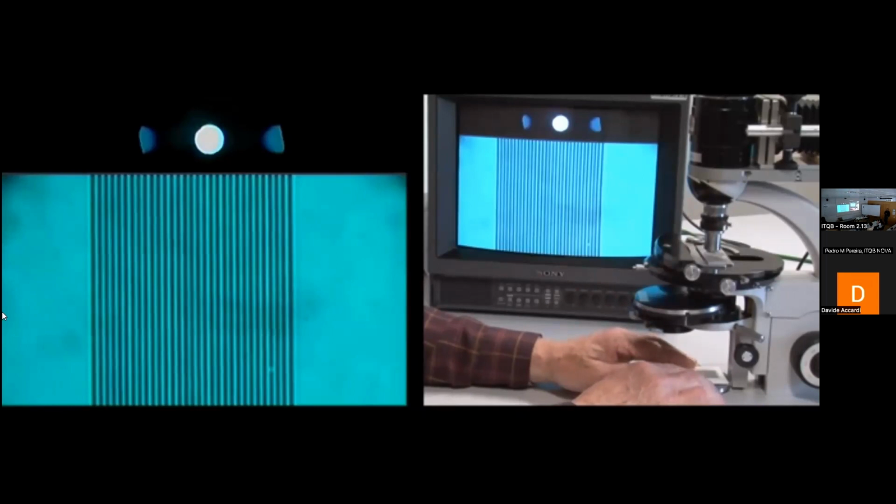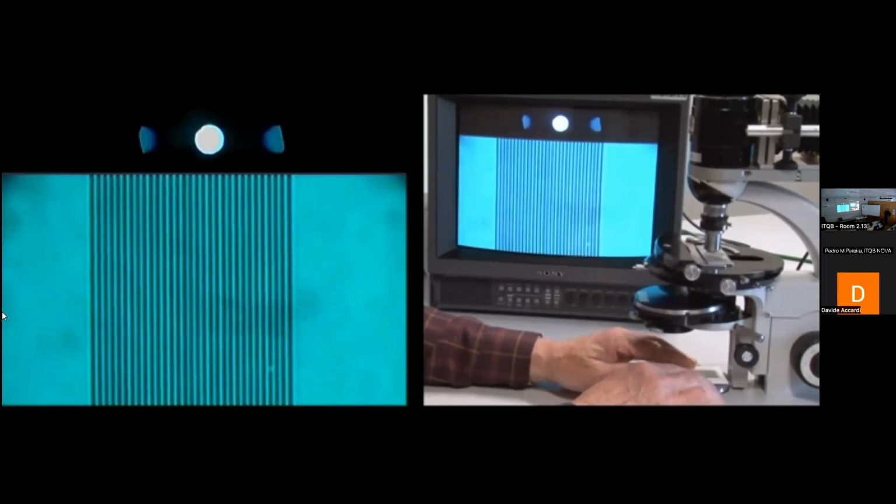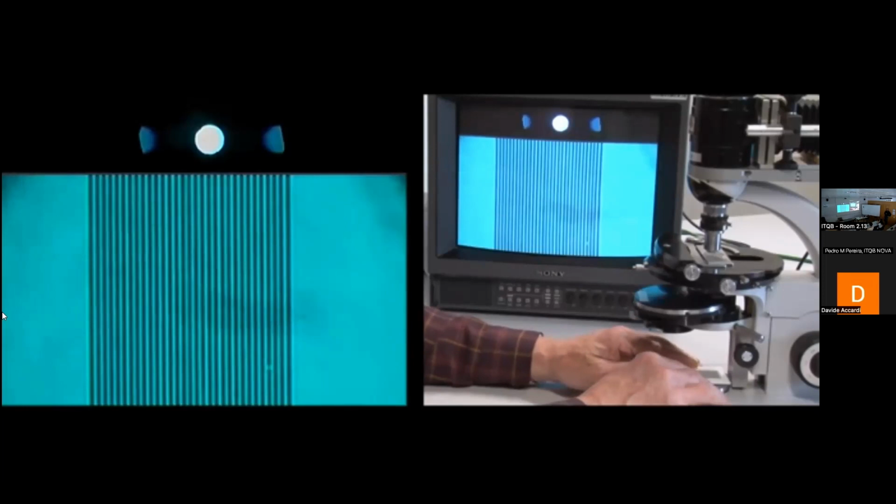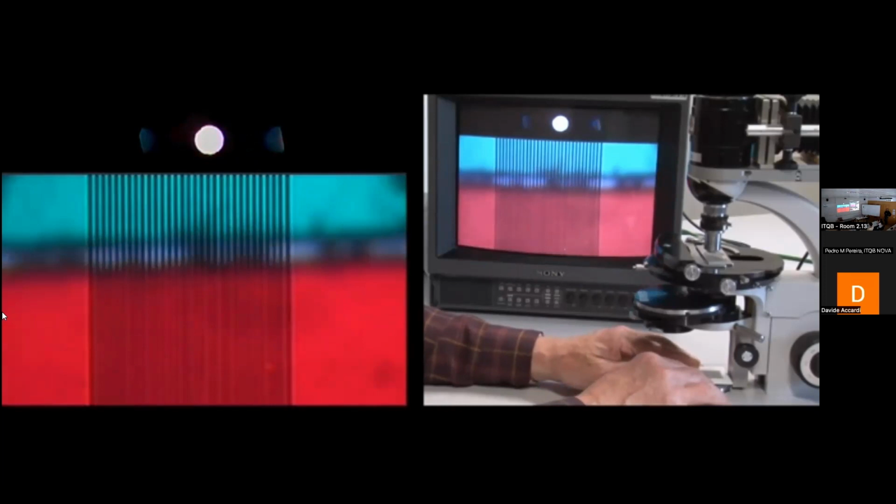And the reason why is obvious, that some green diffracted light of the first order is squeezing through that carefully adjusted opening, whereas that opening is not sufficiently large to accommodate the more widely diffracted red light. So there you see the grating not resolved in red, resolved in green, and if I go to the junction between the two colors in the filter, you'll see simultaneously that we have resolution in the green, but not in the red.